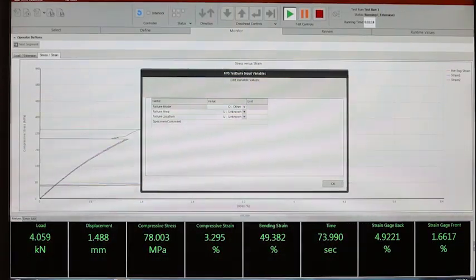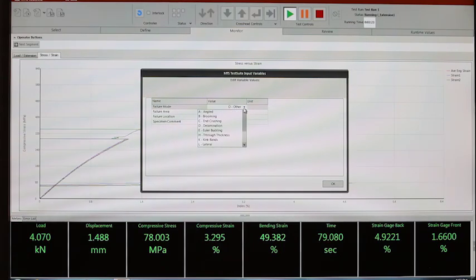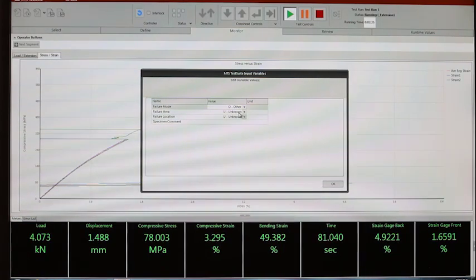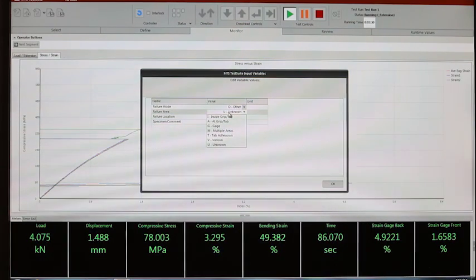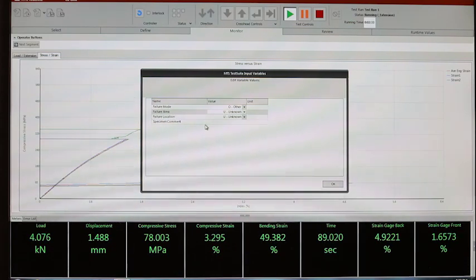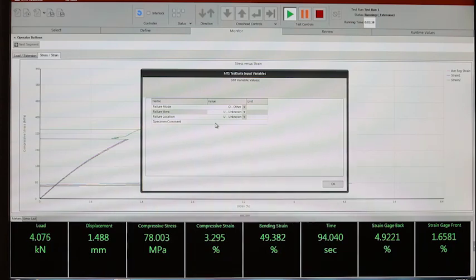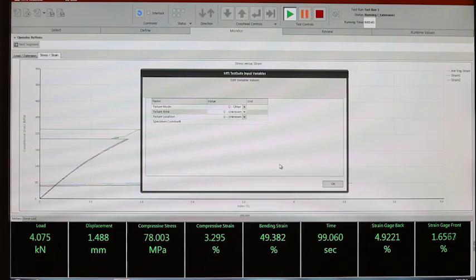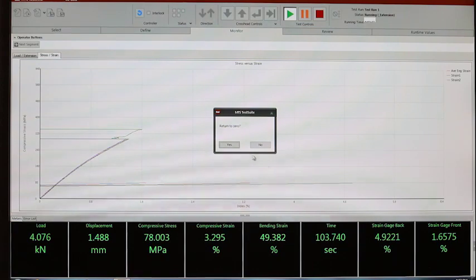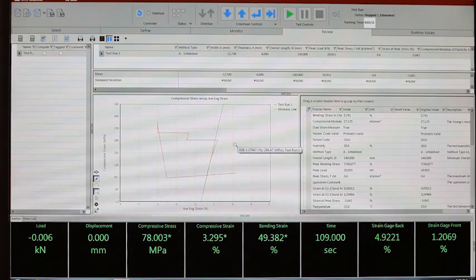After the test is completed, we can enter the failure mode that occurred. We can also enter information with regards to where the failure occurred — the failure location — and any specific specimen comment in order to keep track of what actually happened during the test. After the test is completed, we can automatically return to zero to be ready for the next test.